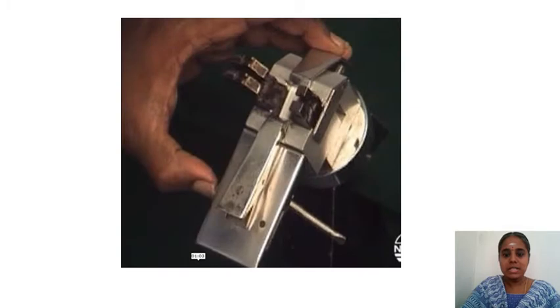So this is the picture which we saw already. This is the preparation of the fibers or the clamps before placing them for testing. The fibers are placed in the clamps and tightened, and only then placed in between the jaw holders.